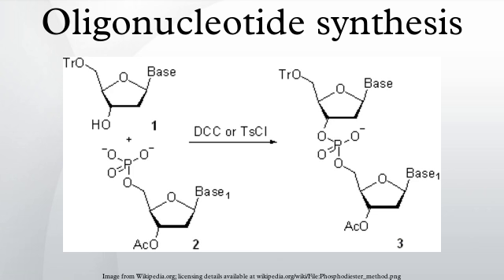Non-nucleoside phosphoramidites. Non-nucleoside phosphoramidites are the phosphoramidite reagents designed to introduce various functionalities at the termini of synthetic oligonucleotides or between nucleotide residues in the middle of the sequence. In order to be introduced inside the sequence, a non-nucleosidic modifier has to possess at least 2 hydroxy groups, one of which is often protected with the DMT group while the other bears the reactive phosphoramidite moiety. Non-nucleosidic phosphoramidites are used to introduce desired groups that are not available in natural nucleosides or that can be introduced more readily using simpler chemical designs.